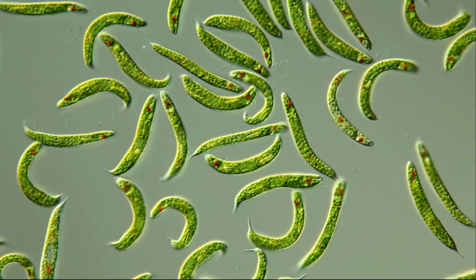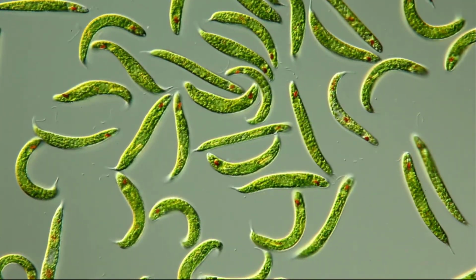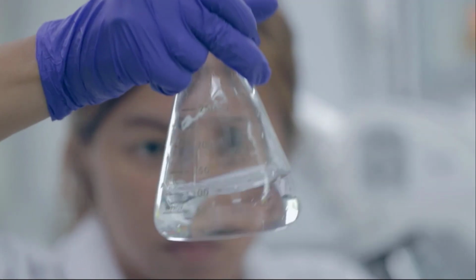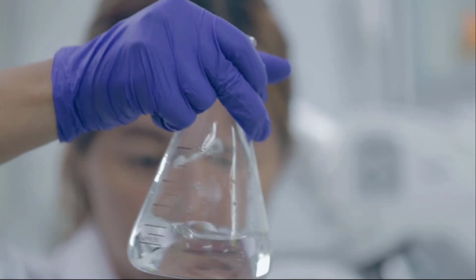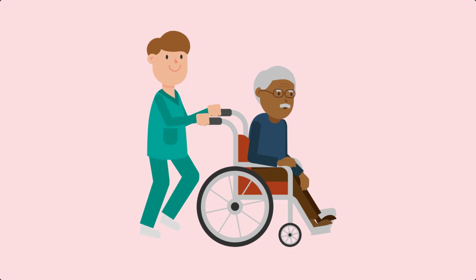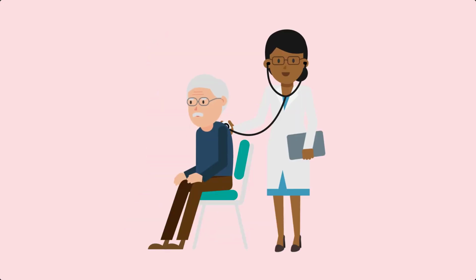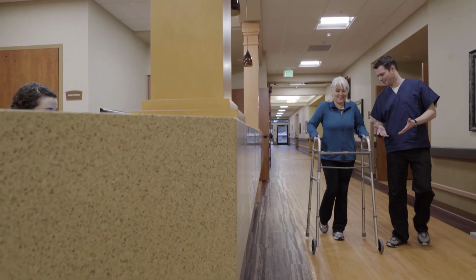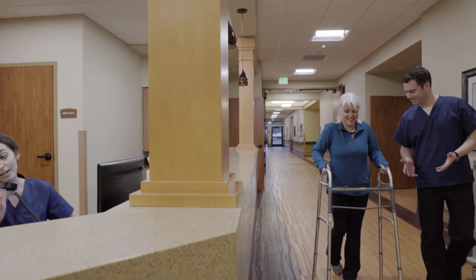Even if the microorganisms you are studying are not usually considered pathogenic or disease-producing, any culture of any organism should be handled as if it were a potential pathogen. With current medical practices and procedures, many patients with lowered immune defenses survive longer than they did before. As a result, the organism can cause disease in them under the appropriate circumstances.